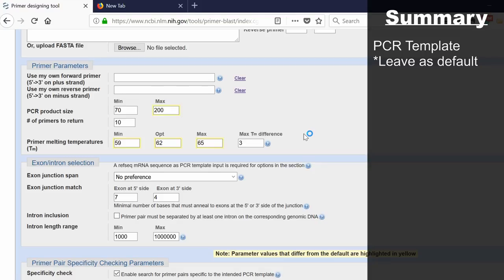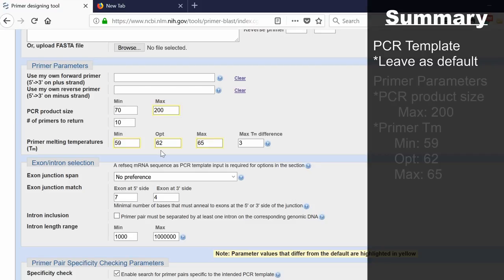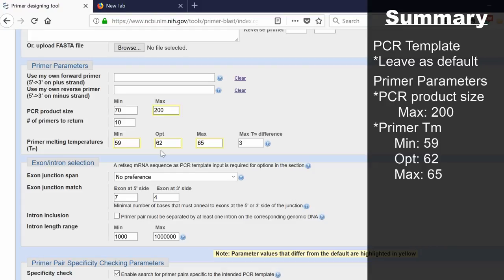As a very loose guide, the melting temperatures of your primers should be 3 to 5 degrees higher than the annealing temperature you want to use in your PCR reaction. For example, I'm selecting around a 62 degrees optimal temperature that I wanted to pick. The reason I've done this is because I want to aim for around a 60 degrees annealing temperature for my PCR reaction.